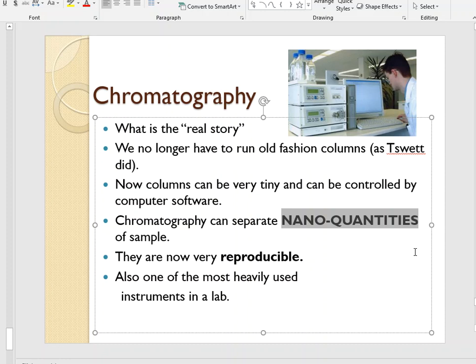And chromatography can pick those components up. It can see those analytes, and it can report those very well with very minimal problems. So these are very powerful pieces of equipment that we're going to be talking about this entire semester as far as chromatography goes.